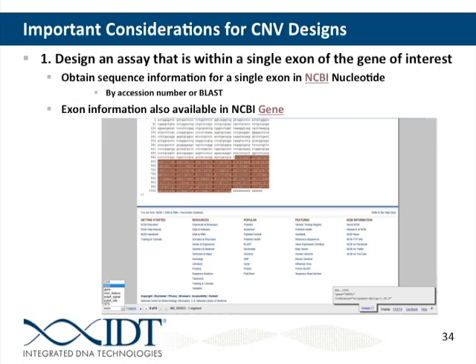So an example of that, we just go to NCBI, nucleotide.